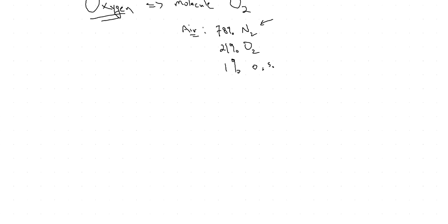The first thing we do in this lab is we look at the decomposition of oxygen containing elements.